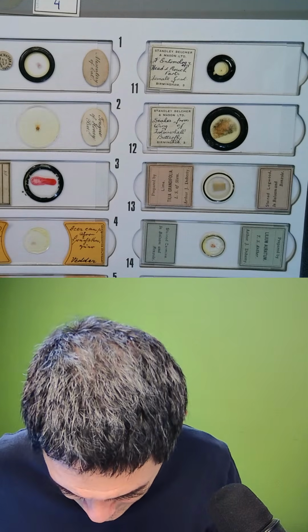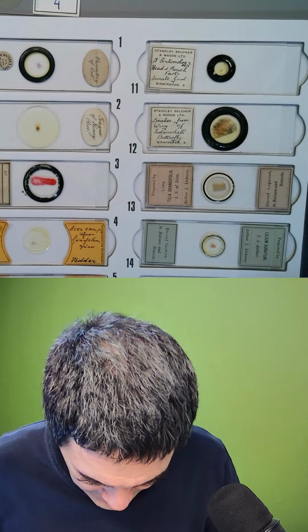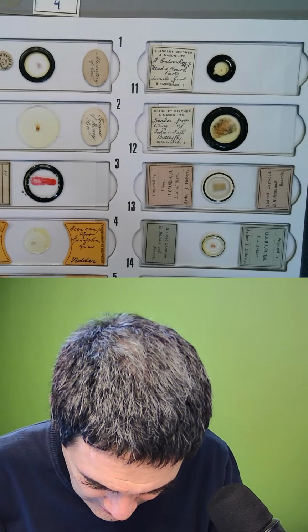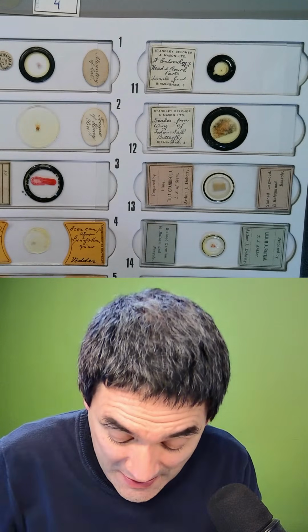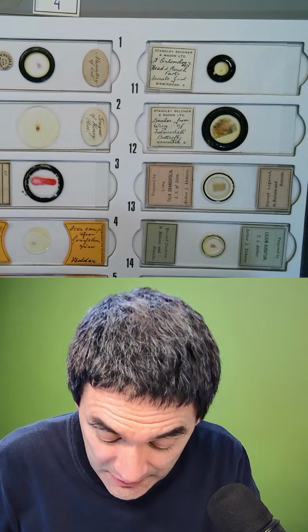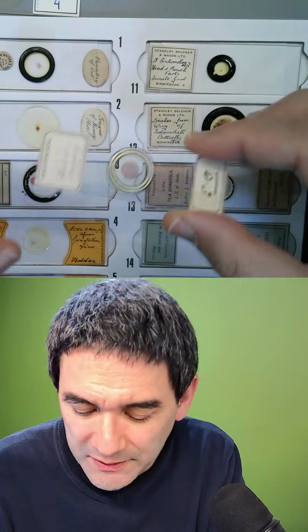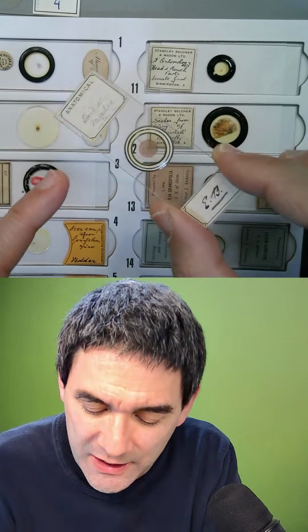I should probably have indexed them better, but this one over here is a... I just want to show you some slightly controversial ones. I like this one so much, and when I made a video of this, people were not so interested. But this one has a very high educational value.